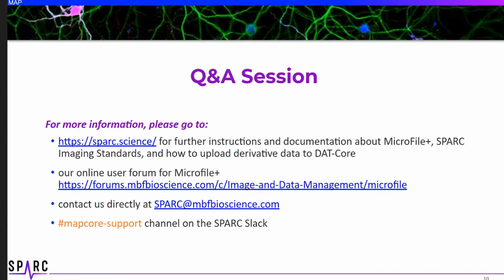I think that same concept hits on this other question, which is MicroFile Plus converts image file types to other compatible formats while retaining metadata. But are there other advantages to using MicroFile for saving stacks? I only use ImageJ, so I do not need to take advantage of converting it to another software. I think that is an important consideration.